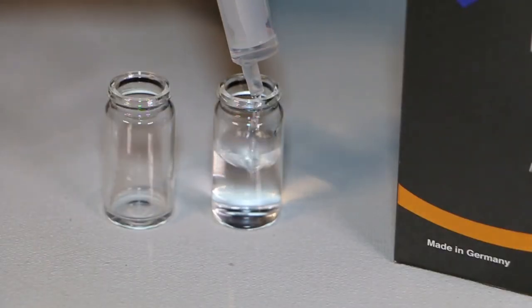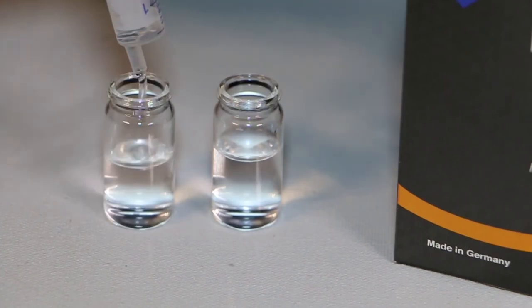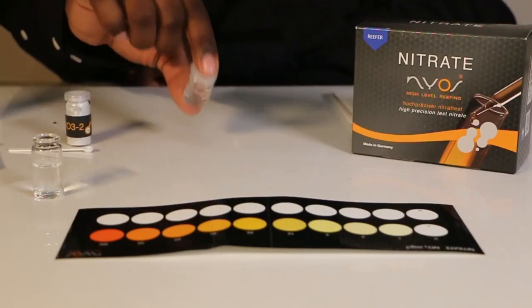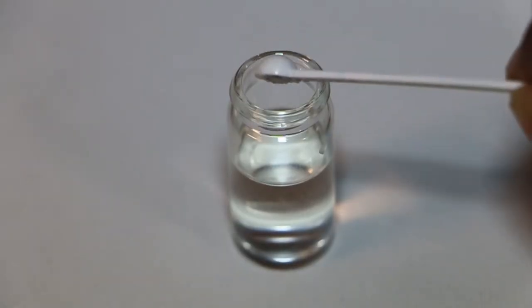First, take the two clear vials and fill both of them with five milliliters of aquarium water, then put one of them to the side. We'll then place five drops of the first reagent into one of the vials and give it a little shake.